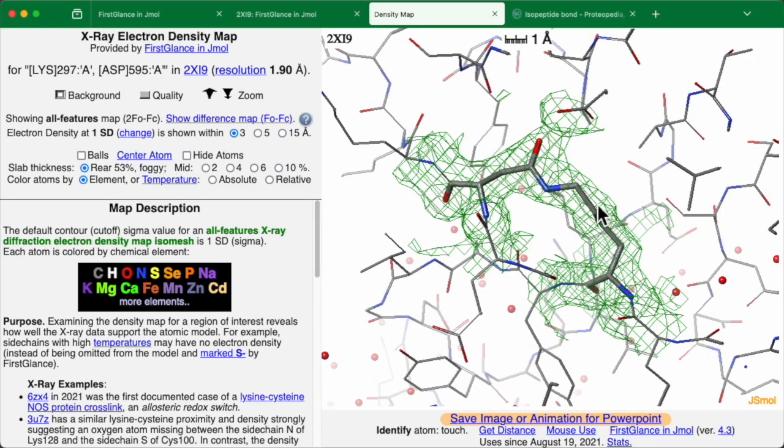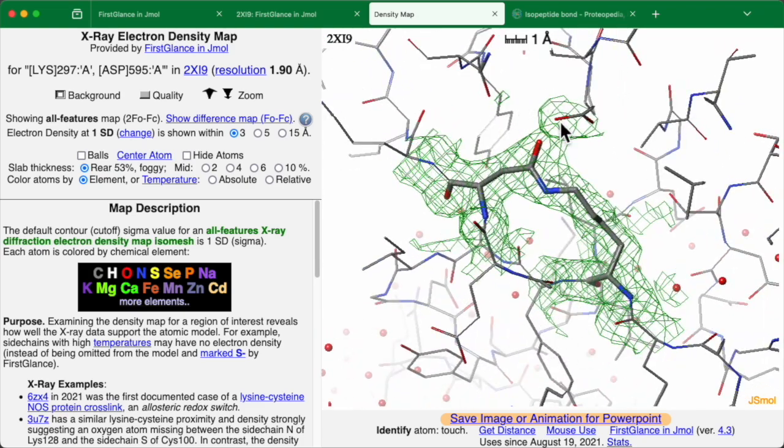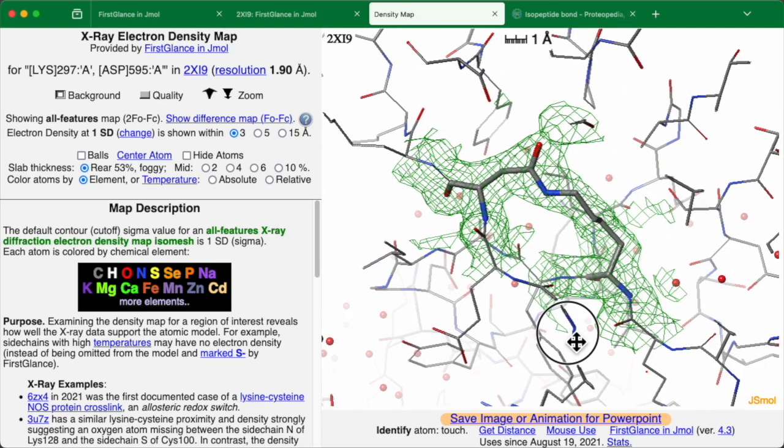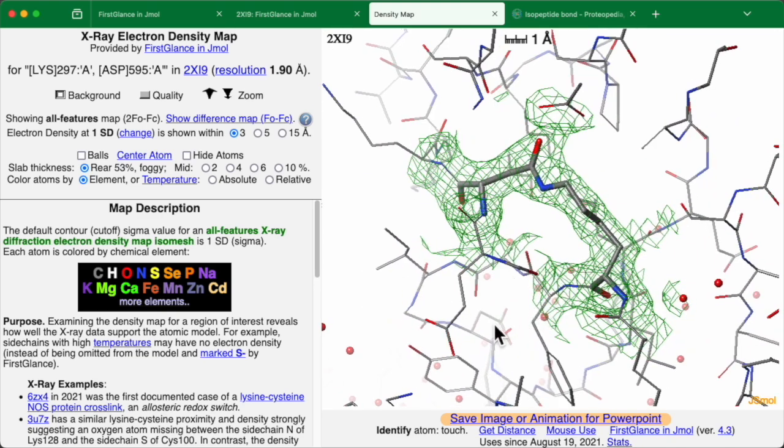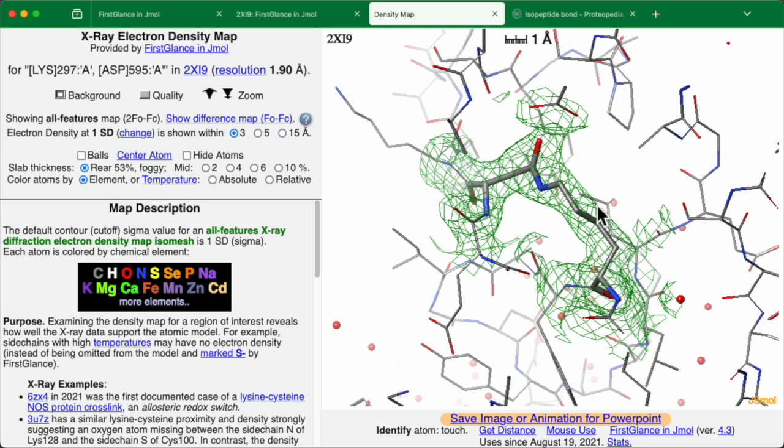And you can see that yes, each atom in this isopeptide bond region is surrounded by a very clear, nice electron density. So we can conclude that this appears to be a real isopeptide bond. And you would expect to have this kind of good quality electron density map fit to the model at the resolution of 1.9 angstroms here.